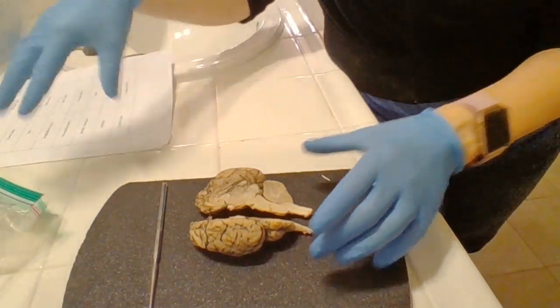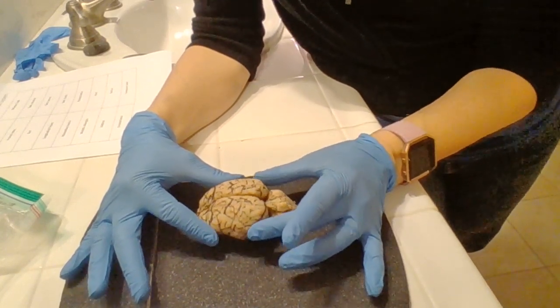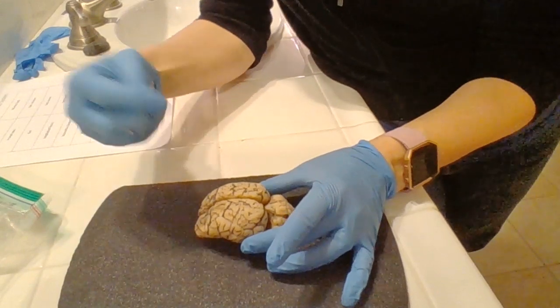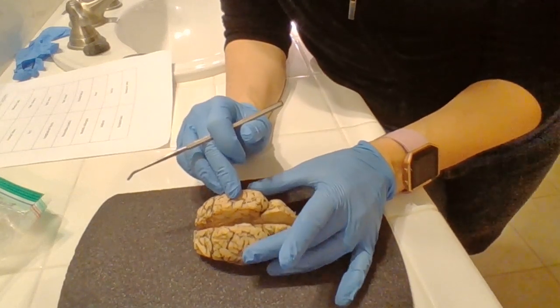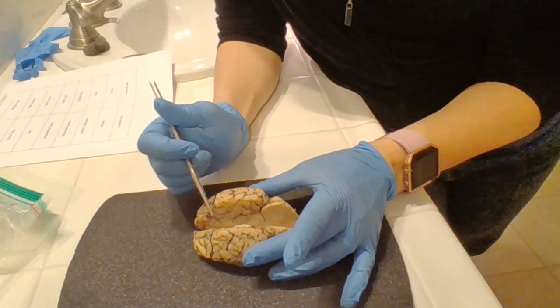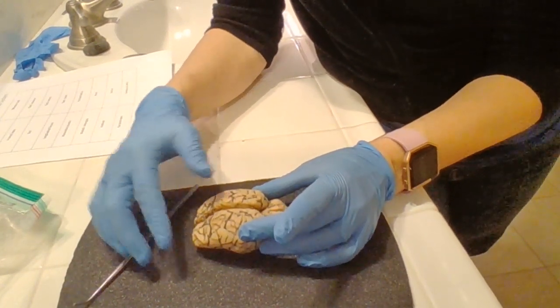When I first opened up the brain, it had this really thick covering on it, like a plastic bag. And that is the meninge. I had to cut away the meninge, and it was pretty thick, so that was really interesting. And then this is a longitudinal fissure. I had to pull apart the hemispheres right here, and in between was the corpus callosum, which helped keep the two brain hemispheres together. So that was pretty cool.